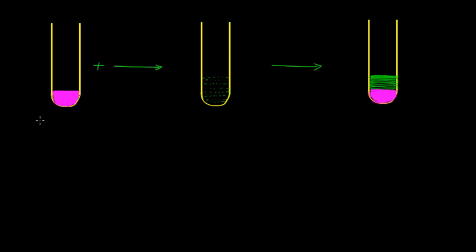If the compound is a base in your test tube, so let me write here as a base. Now here we can take any base, and that base can be detected by adding the concentrated HCl or 1:1 HCl into this test tube.